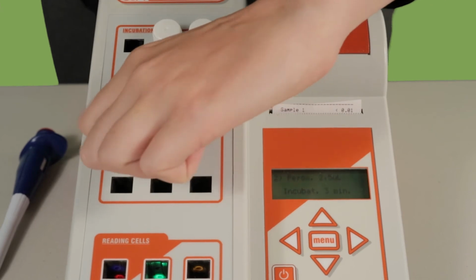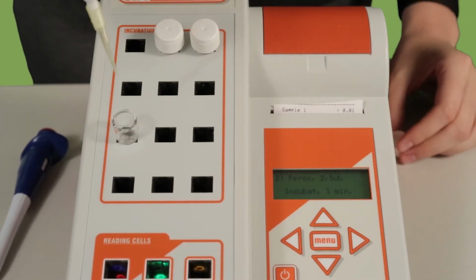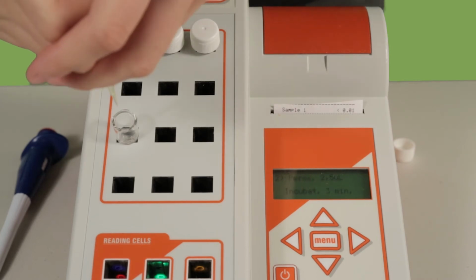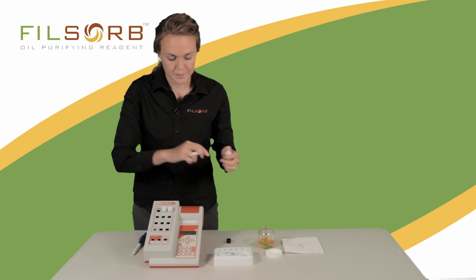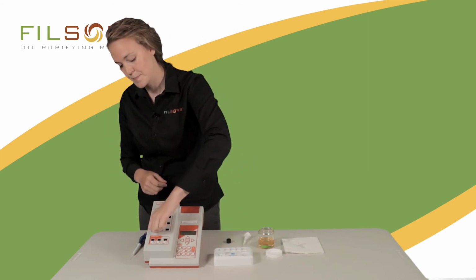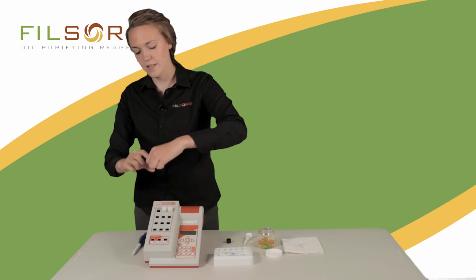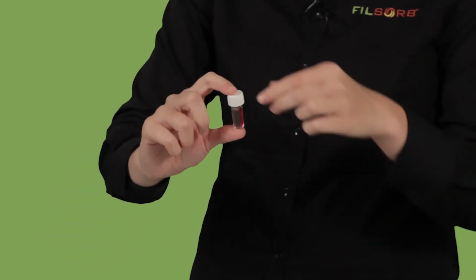When you are putting this into your cuvette, you do not want to touch the wall of the cuvette or the reagent. You hold it above and firmly press. And replace your cap. Again, invert your cuvette to homogenize the mixture.